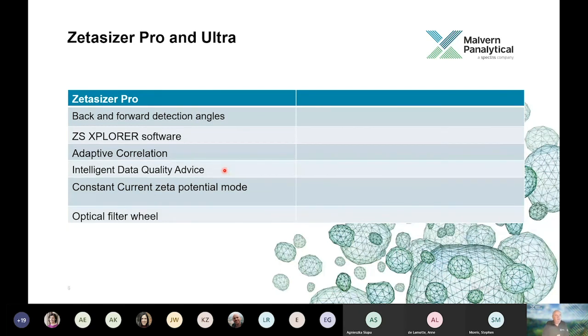But often they're on such rapid timescales that we don't see them on our correlator delay times. However, if we're dealing with high aspect ratios, we see this happen quite a lot in metal colloids like colloidal gold, colloidal silver, we see peaks appearing at very small sizes, which are due to the rotational component. And the polarizers in there allow us to differentiate the rotational component from the translational component.